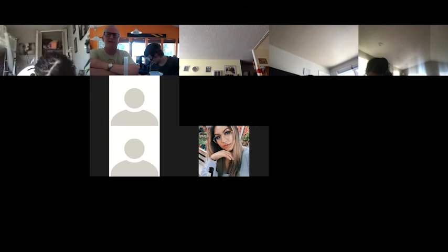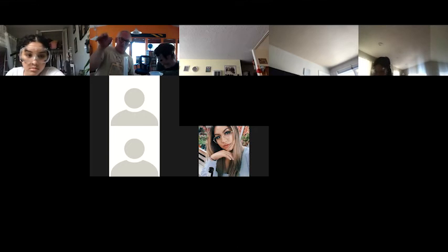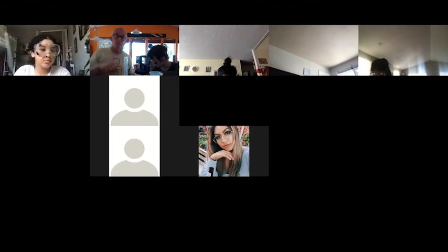Basically it means we're just pouring off the liquid and trying not to pour off the solid. So like when you decant a wine, for instance, if there's schmutz at the bottom, you're trying to get the liquid out and leave the solid behind. In this instance, we're doing the same thing, but we're throwing the liquid away and holding on to the solid, because the solid is the product we want. So we just slowly pour it, and you can pour it in whatever container you want, so that the blue liquid's gone, but the brown solid remains. And then we're going to rinse it with water a couple times.